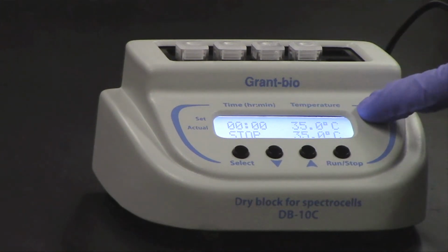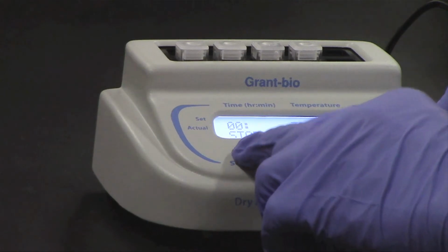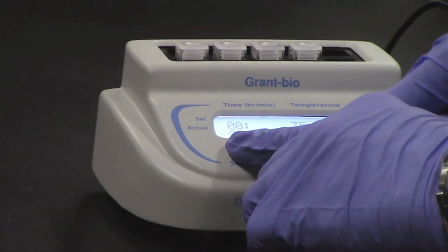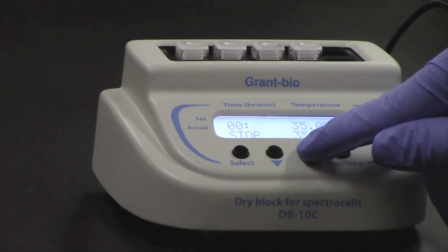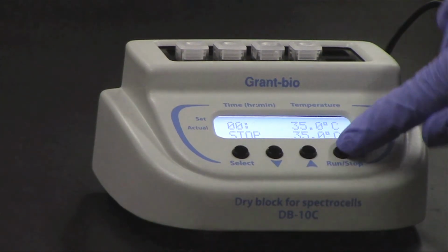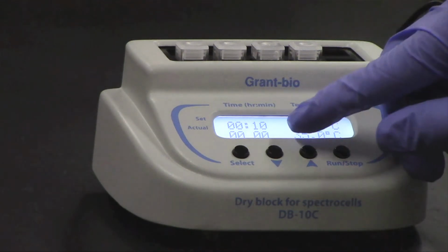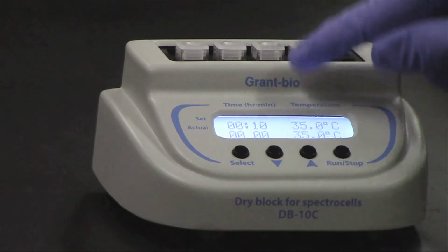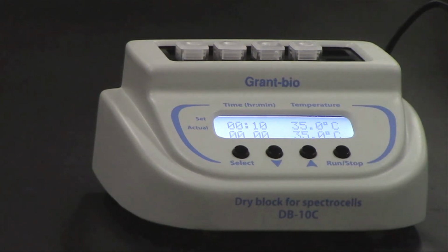Now the actual temperature matches the set temperature, so it's safe to say that these are actually at that temperature, but in order to allow them to equilibrate, you'll want to use the timer setting, and you can set this to, say, 10 minutes, and hit Run/Stop, and you'll be able to hear a beep at the very end when it hits the desired amount of time, which in this case is 10 minutes.